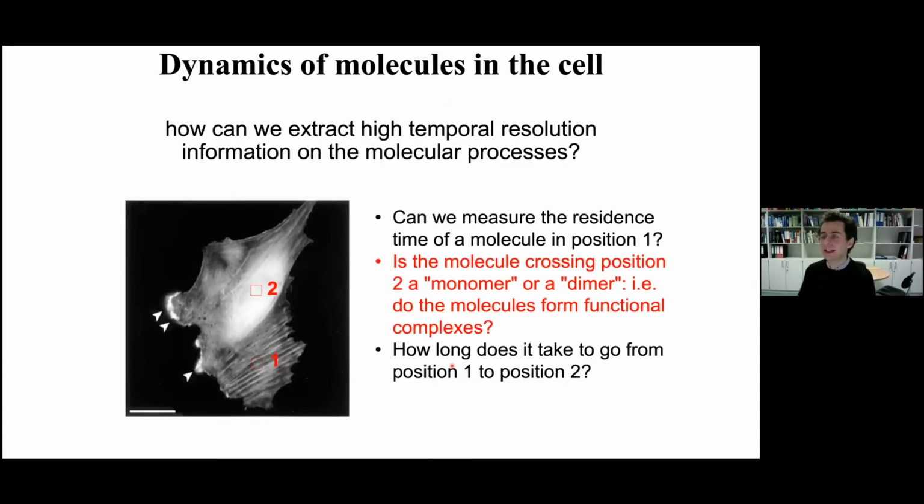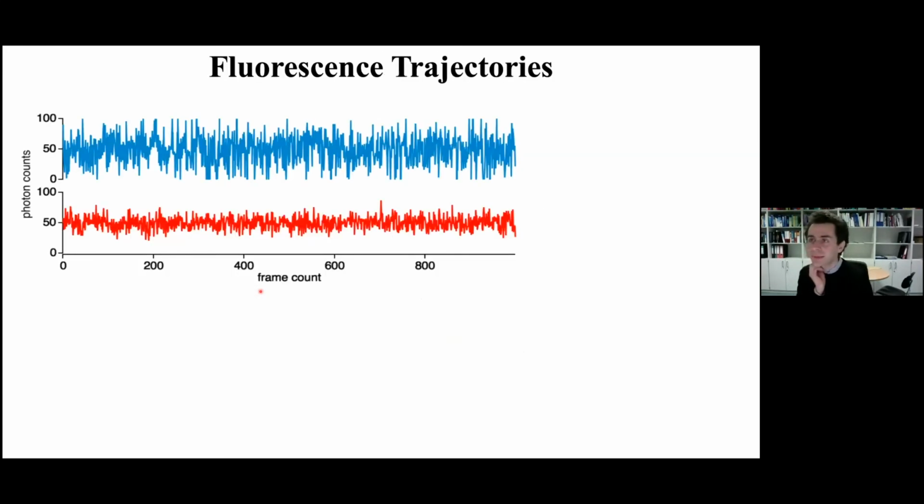The other question you can ask, another thing important in biochemistry or pharmacology, again going back to the title, is whether things come together or not. So 2 molecules will come together to do some work together, or a drug could bind a target to exert its action. So the question is, I want to know if 2 molecules in my sample are by themselves or are in complexes. Okay, and then I want to show you this chart. Again, if there is time, I will maybe ask for a quick feedback.